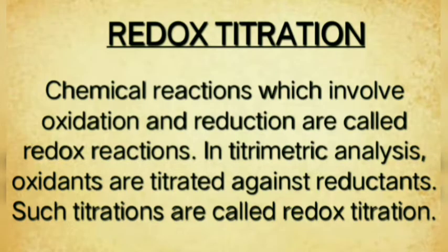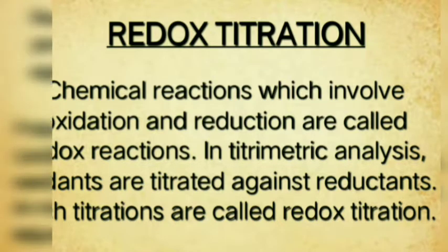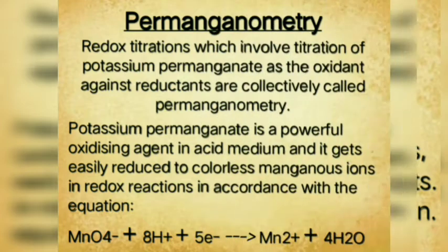In this experiment, we are going to perform permanganometry. Redox titration. Chemical reactions which involve oxidation and reduction are called redox reactions. In titrimetric analysis, oxidants are titrated against reductants. Such titrations are called redox titration.